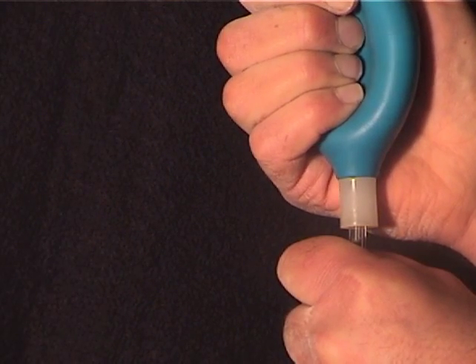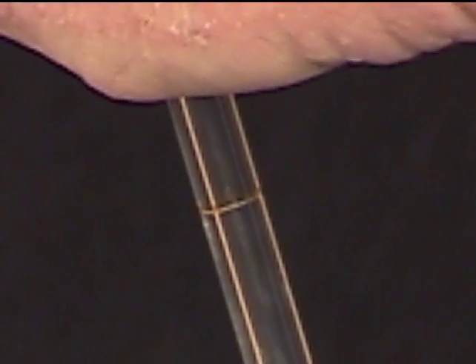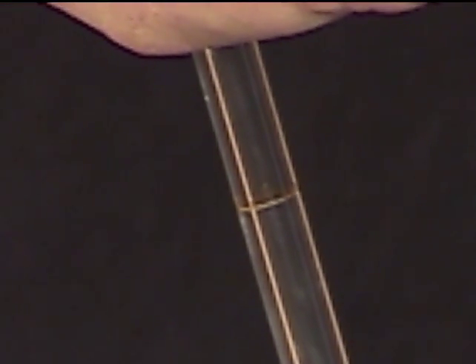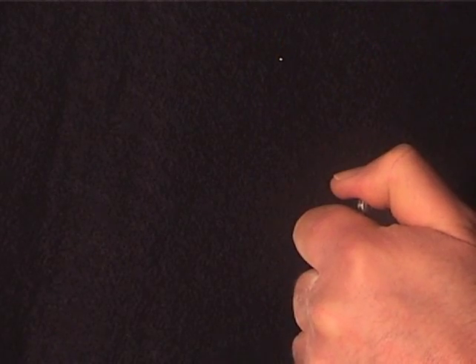Allow the rubber bulb to expand to draw the liquid sample into the pipette. Let the liquid's level pass the etched mark on the pipette, then quickly remove the bulb and seal the top with your thumb.